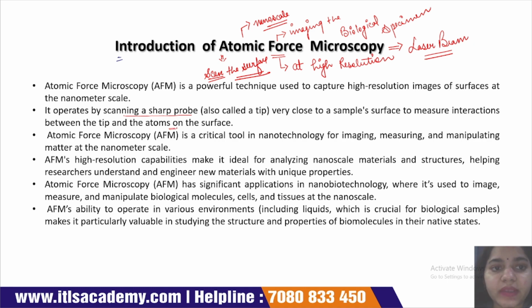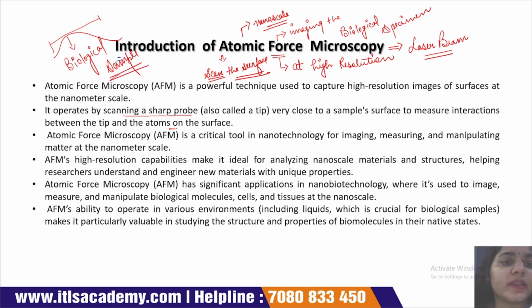Suppose this is a biological specimen and we want to visualize its structure. Then we simply scan the cantilever tip across the surface of this sample and analyze the result.